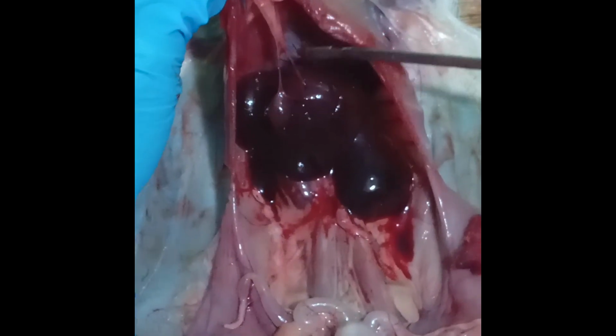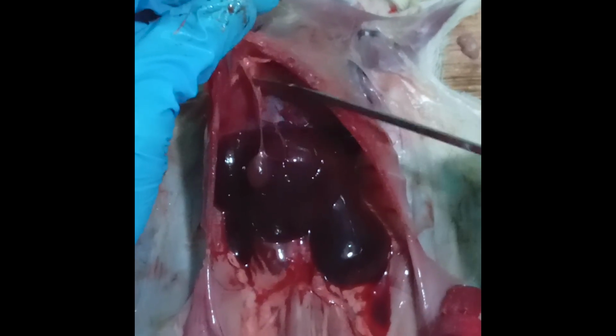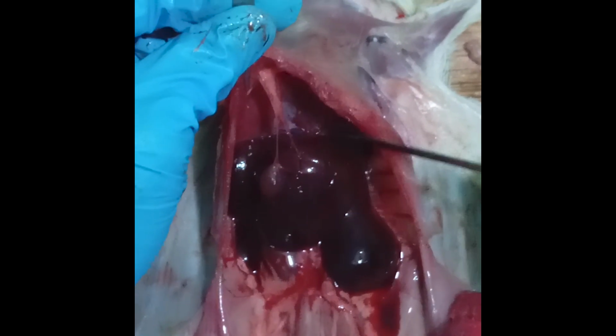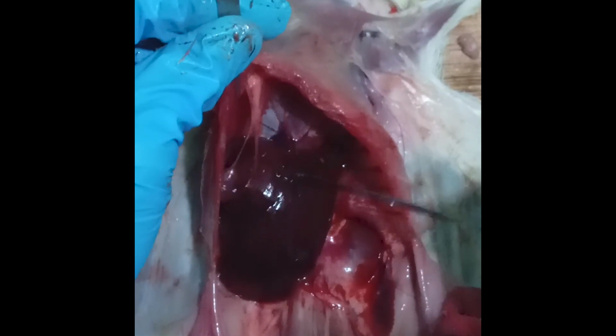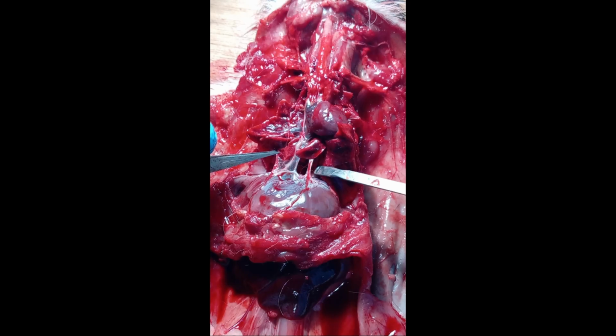Now, the central tendon is also found attached to the diaphragm on the lower surface of the diaphragm. So, see, that's the central tendon. That's the diaphragm. So, you see, you have the central tendon, you have the diaphragm, and you have cords from the central tendon on the lower surface of the diaphragm that is attached, one to the gallbladder and another cord to the liver, to hold the liver and gallbladder in place in the abdomen. So the central tendon of the diaphragm does that too.